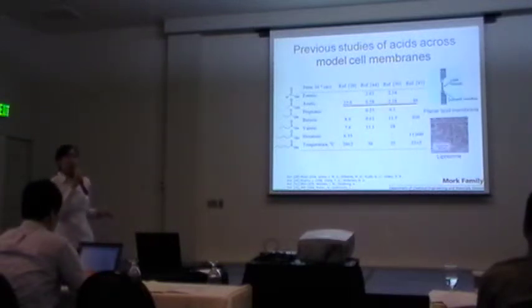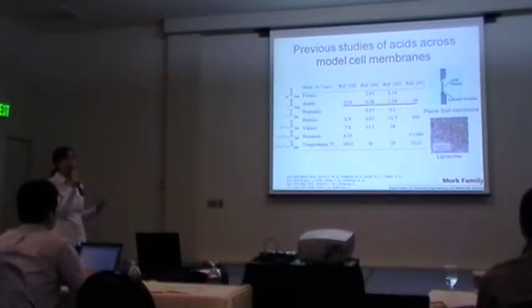And here, planar lipid membrane and the liposome are the two most used systems to test small drug permeation through the lipid membrane. For the planar lipid membrane, the residual solvent existing in the membrane will greatly affect its properties and its stability, making the planar lipid membrane properties unlike the true cell membrane.